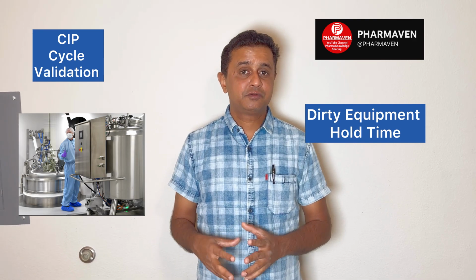In that case, what is the maximum time you have to wait, or you may have to hold the vessel without cleaning? You have to determine that time. For example, that time is 8 hours. Then 8 hours becomes your dirty hold time. So what do you have to do?